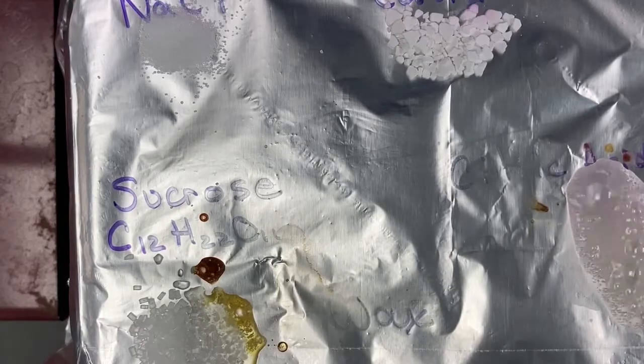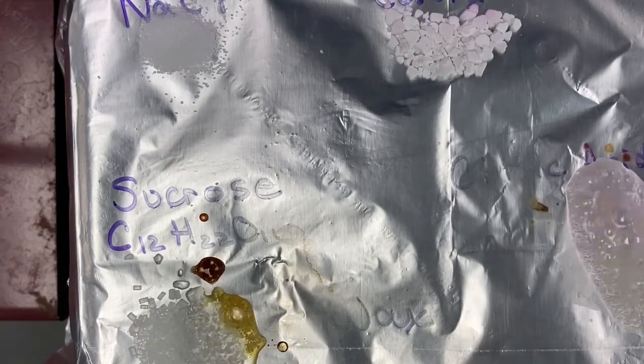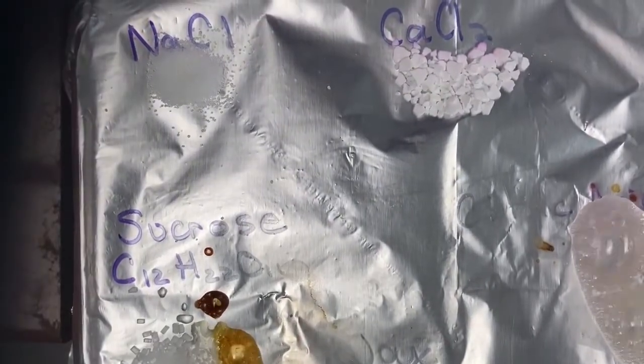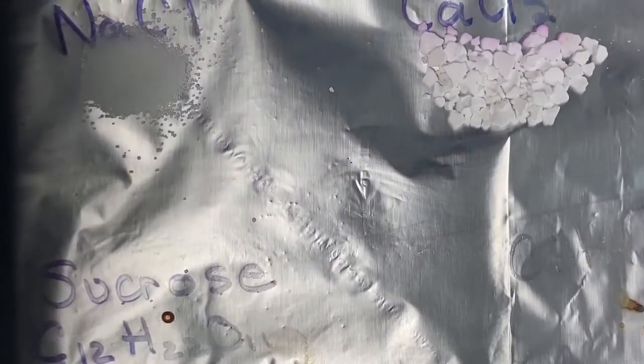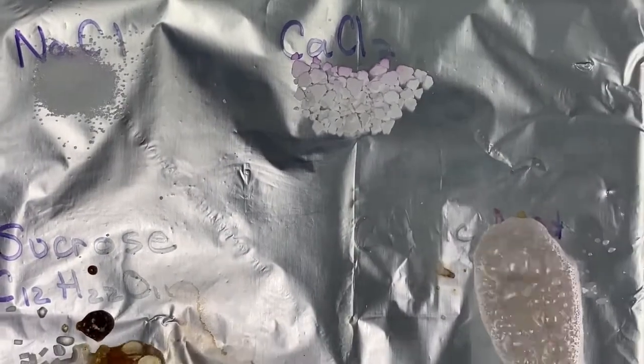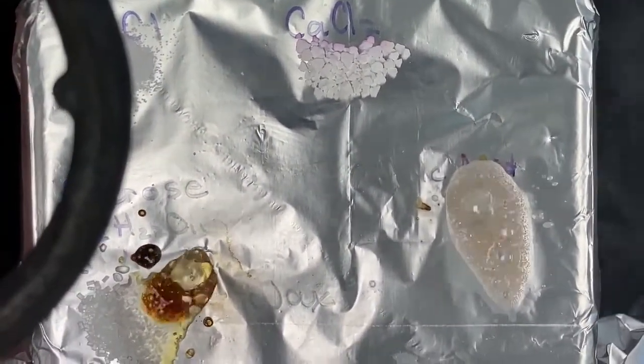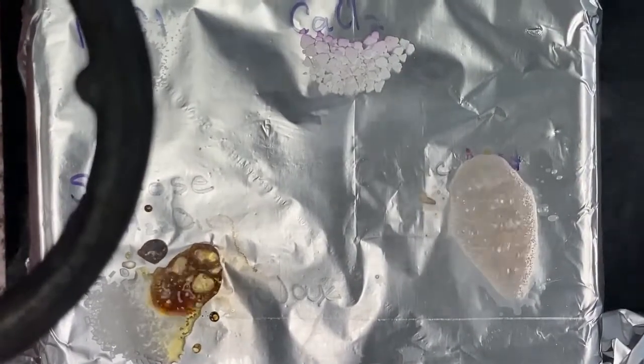And then, so now I have a 1, I have a 2, I have a 3. And the other 2 aren't going to melt. And notice we are getting really, really hot. We're actually starting to boil, which is maybe not a good idea for some of these fumes. So we will now turn it off. I'm going to turn it off and finish your observations.